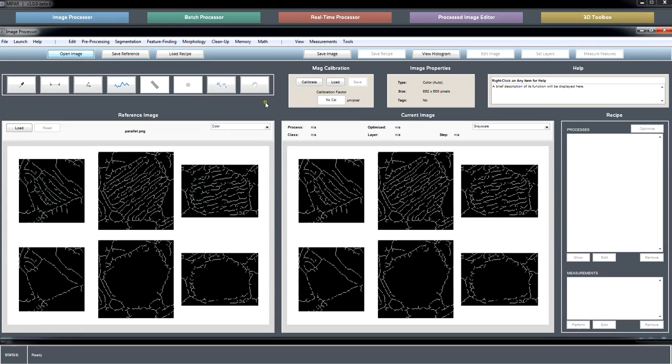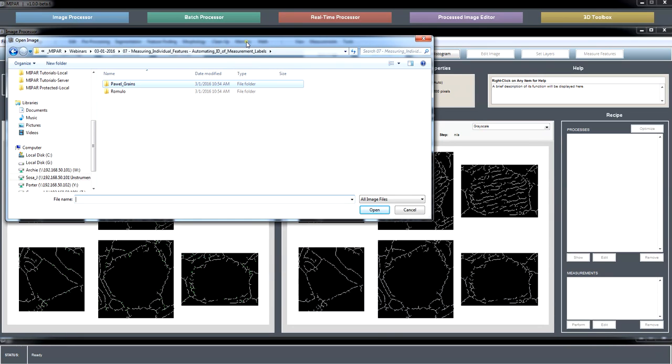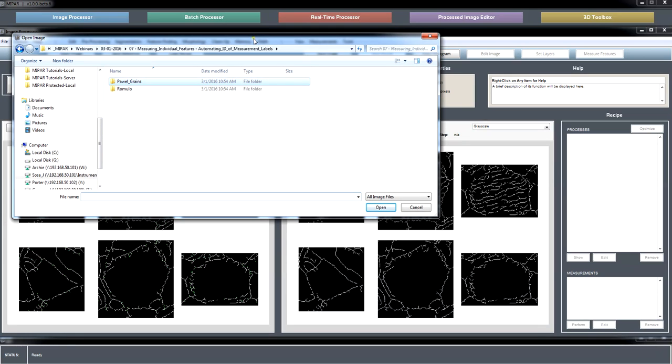Sure. Most of the processing I do on two-dimensional images, I'd say average, they're about 1,500 by 1,000 pixels, a couple of megabytes. On a 2D image, we process all the way up to 4K images. MIPAR definitely does slow down in that circumstance. Not ideal. So if you can stay down near 2000, you should have a good experience. I'd say you'd have a workable experience depending on your hardware, up to 4 and 5K.